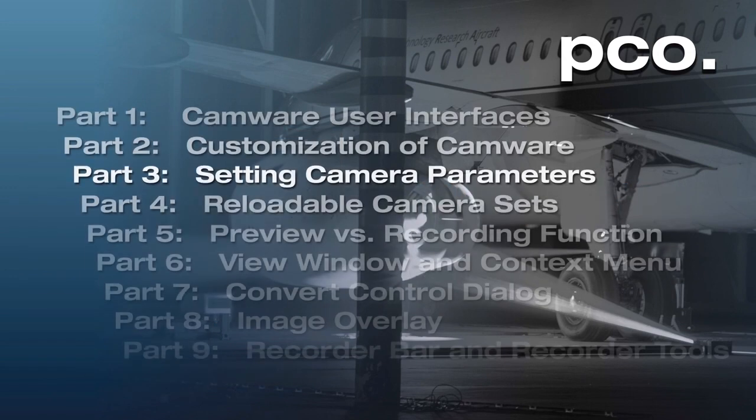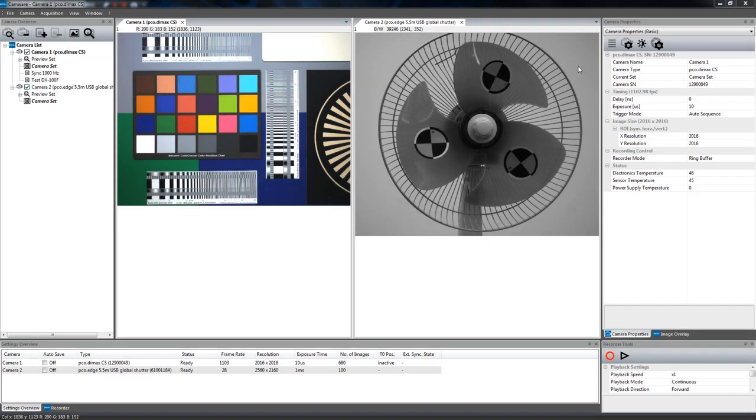Today's video tutorial will guide you on how to set your camera parameters. The Camera Properties window on the right-hand side is the main interface for all camera settings. The active set selected within the camera list is adjusted here.